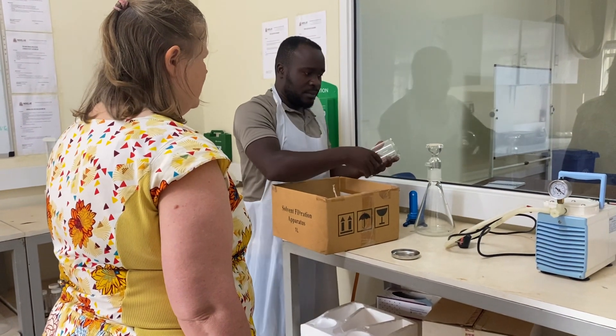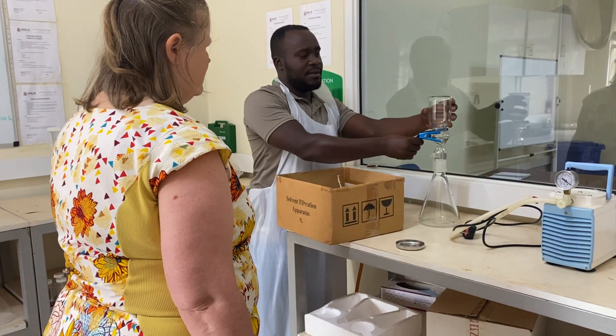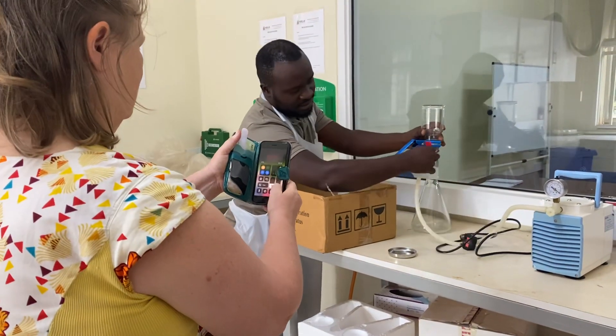I think we do it similar. Like this. So we attach this, like this.